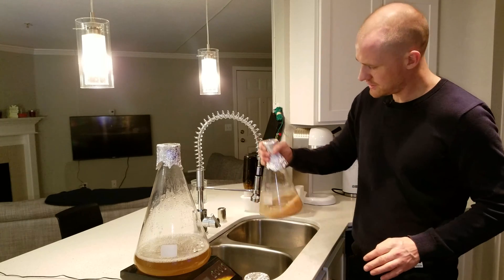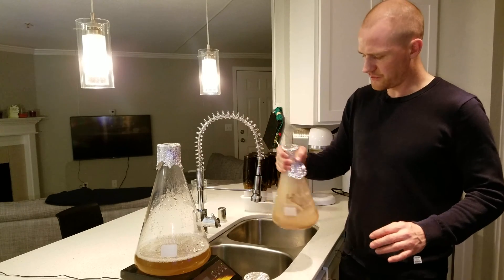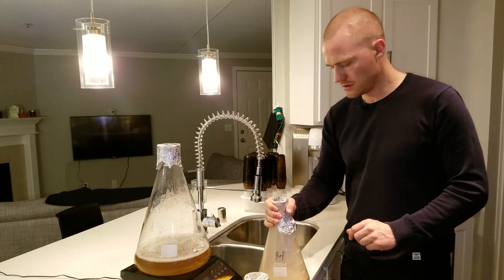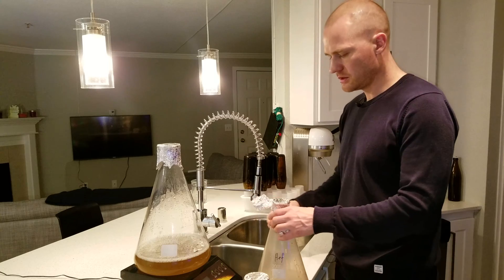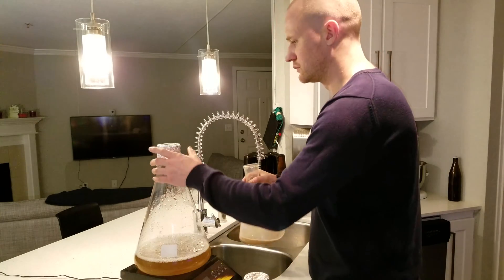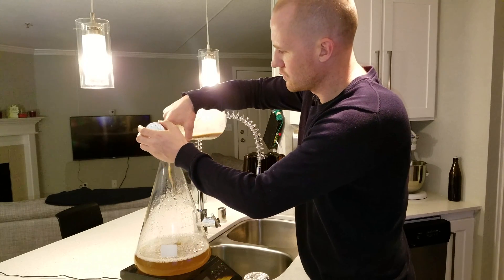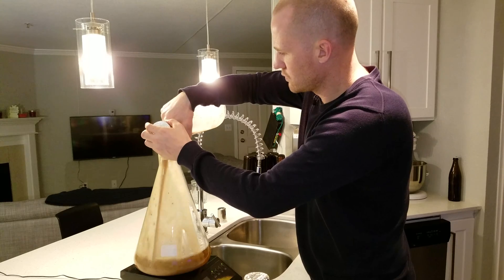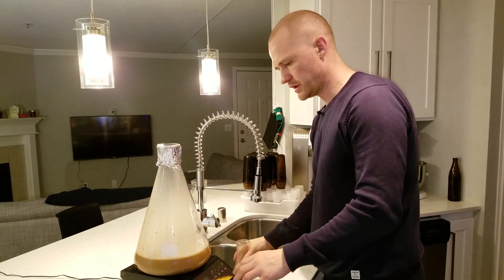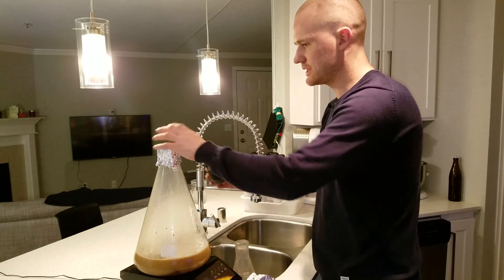Then we'll stir the yeast into solution. Smells really good. Then it's as simple as pouring the yeast slurry into the new yeast starter. From there we add a stir bar — this one's been sanitized.